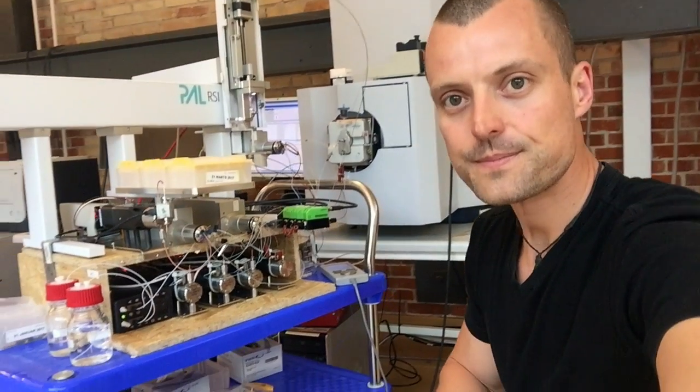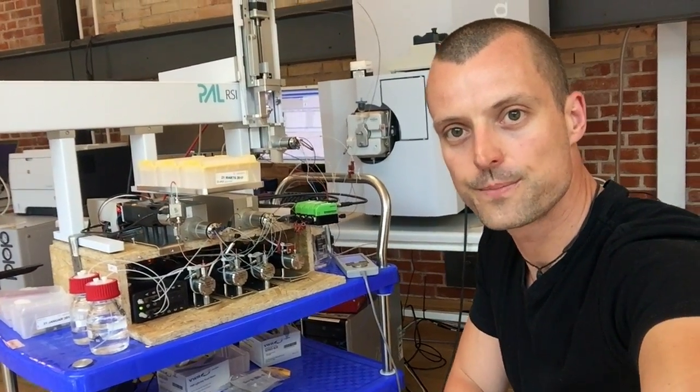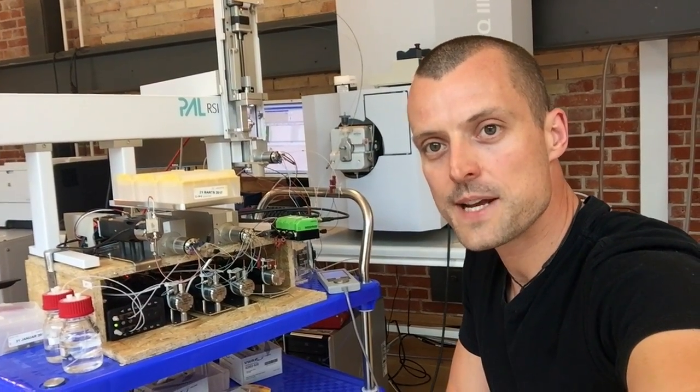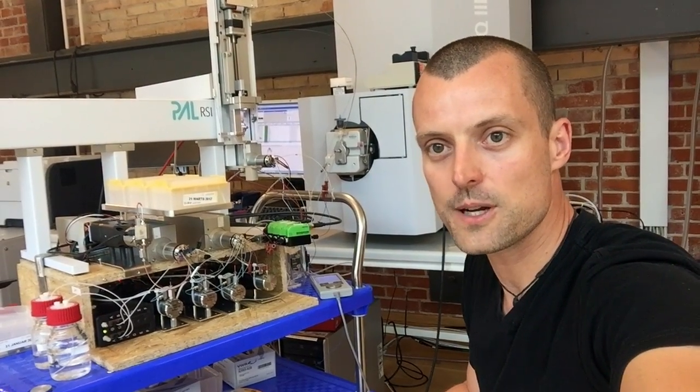Hello, Nikolaj from EVOS F. Today we are going to take a look at our first lab prototype. As you can see, we have built the instrument using chip wood. We have done this because we are now playing around with the industrial design, and it makes it very easy for us to make changes and also move the individual components around.